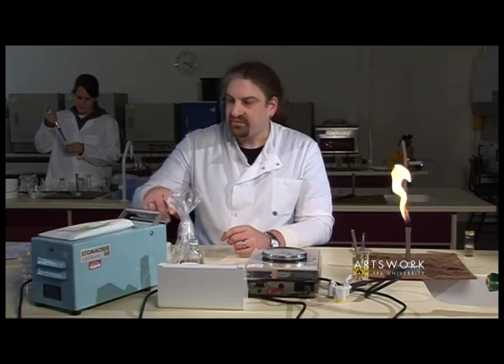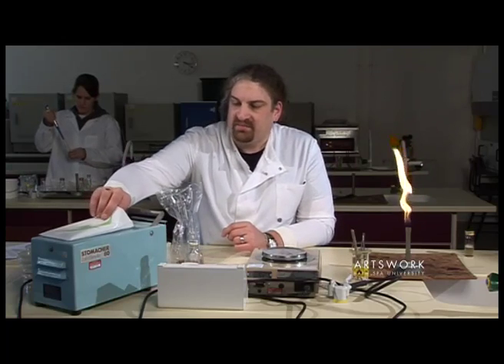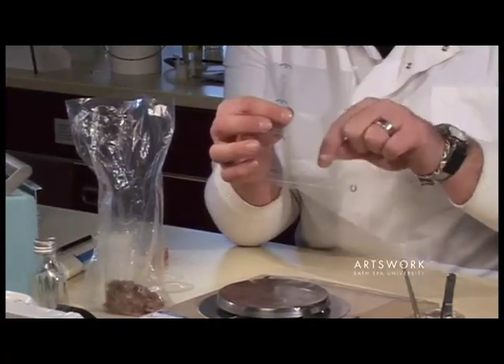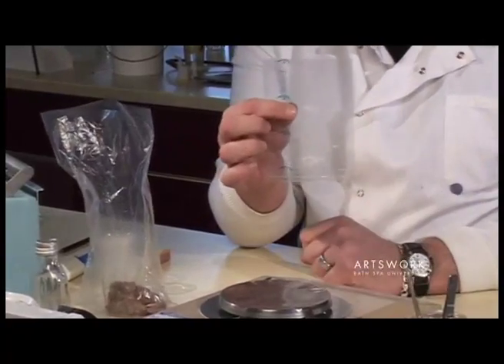We've got a sample of raw meat, and so to prepare our sample, we use one of these sterile stomacher bags. They're sterile plastic bags into which we put our sample and the liquid we're going to dilute them in.